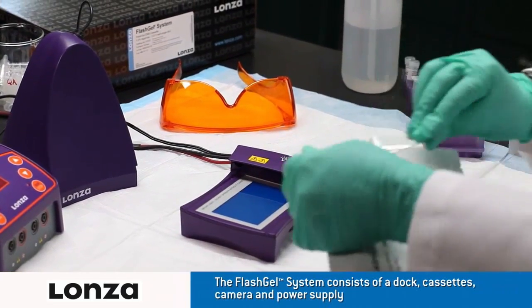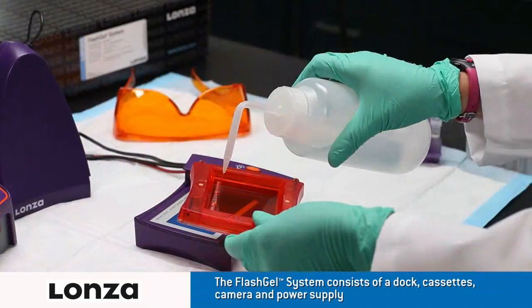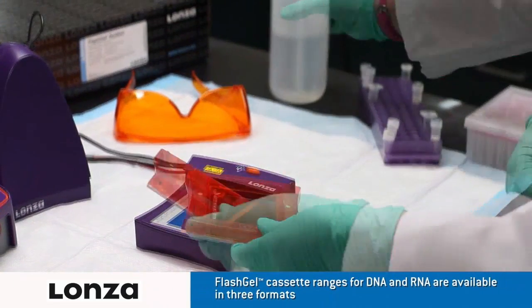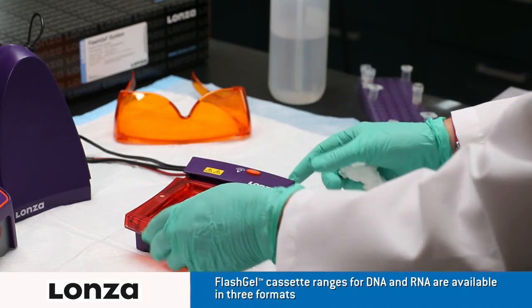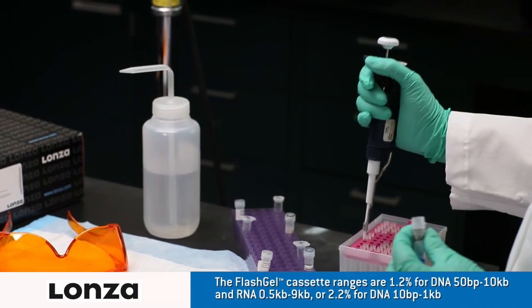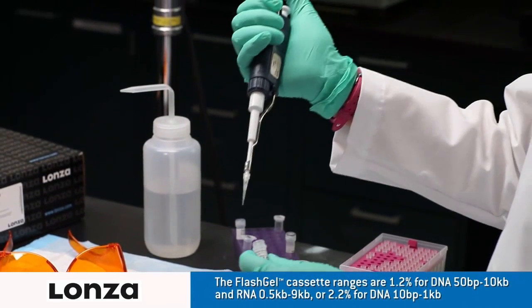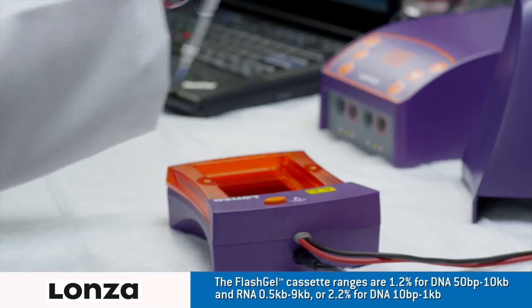Open the FlashGel cassette package. Wet the wells with deionized water. Blot dry any excess water with a lint-free tissue. Load the cassette onto the dock and snap into place. Prepare your samples using FlashGel loading dye and use FlashGel markers, both designed for optimal performance.